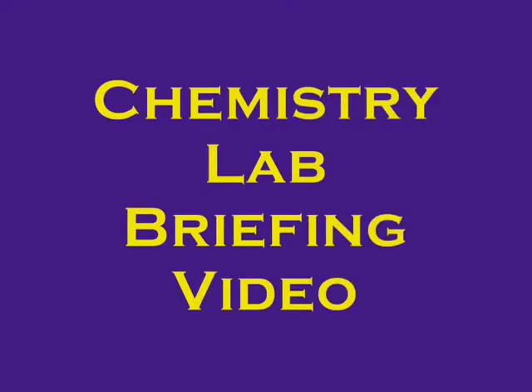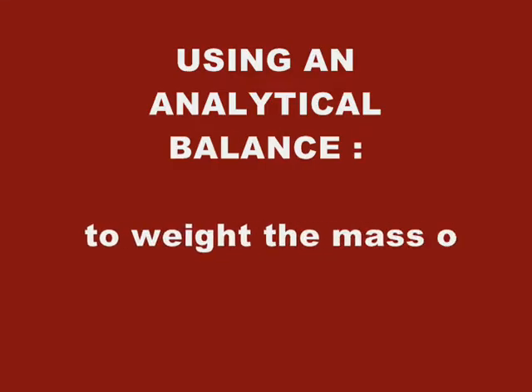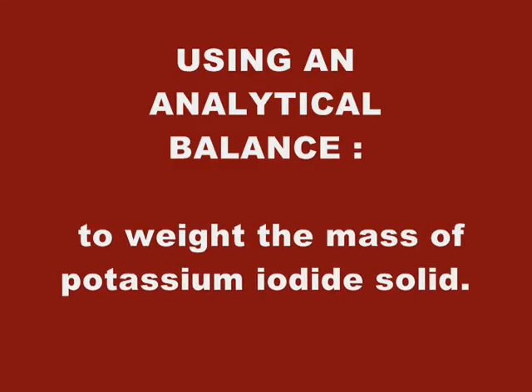Chemistry Lab Briefing video. Using an analytical balance to weigh the mass of potassium iodide solid.